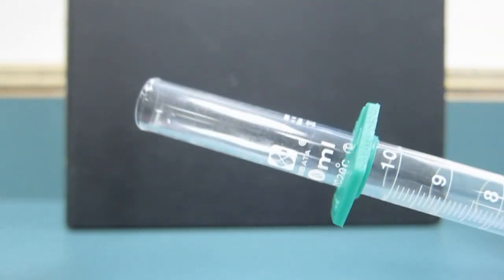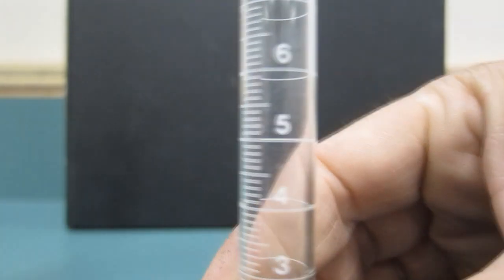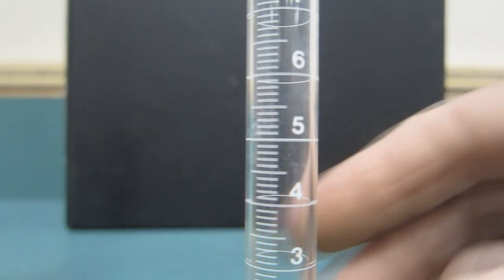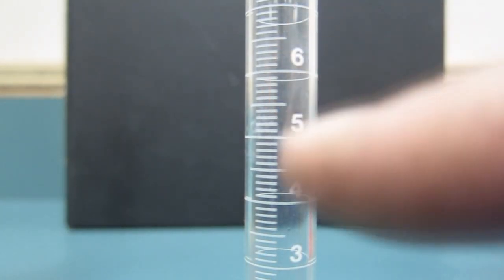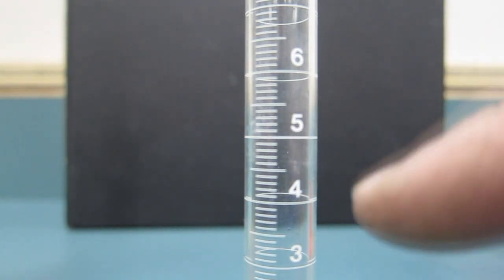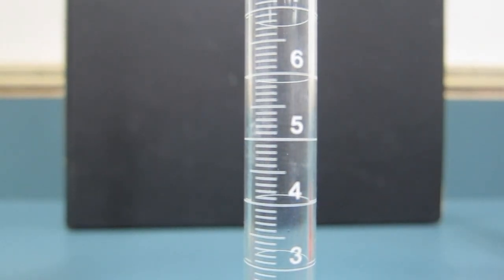And then the other scale, I'm not going to bother to pour water in here. This is actually a 10 milliliter one. This is an incredibly accurate one. And this one is counting by 0.1. See a difference of one divided by ten tick marks. And this would be our most accurate graduated cylinder that I've showed you so far.